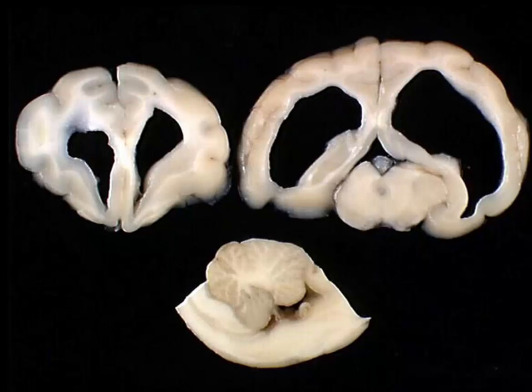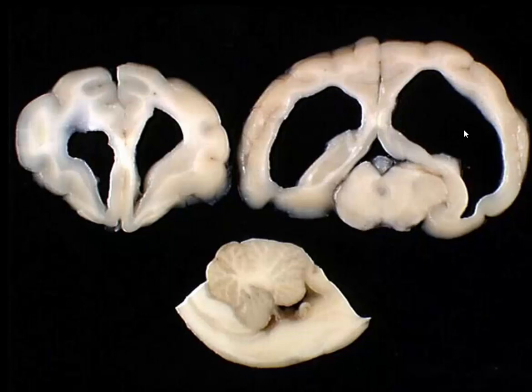We have three sections of the brain of this cat: one from the telencephalon or forebrain, one from probably the diencephalon in the area of the midbrain, and then we have a sagittal section through the cerebellum and the fourth ventricle. First thing you'll notice is that the lateral ventricles, the third ventricle, and the fourth ventricle are markedly dilated, so we likely have something occluding the drainage of cerebrospinal fluid. This most often happens at the smallest, most constricted area — the mesencephalic aqueduct, which drains the third ventricle into the fourth ventricle.